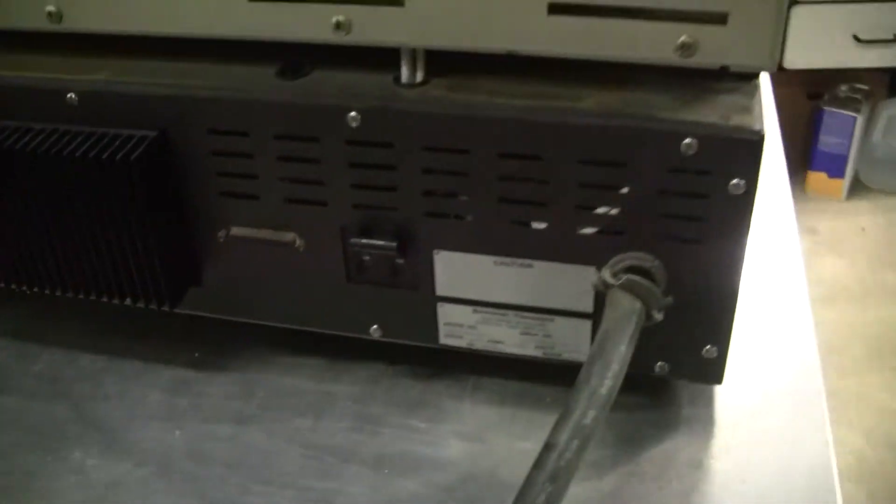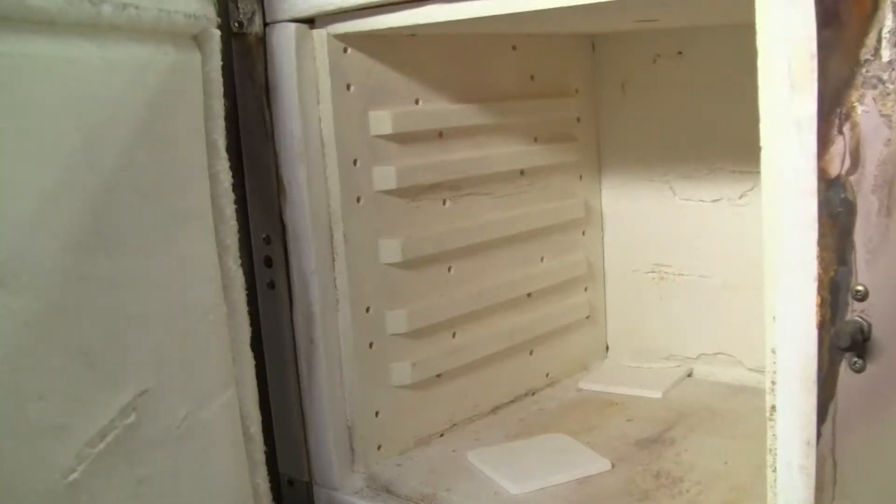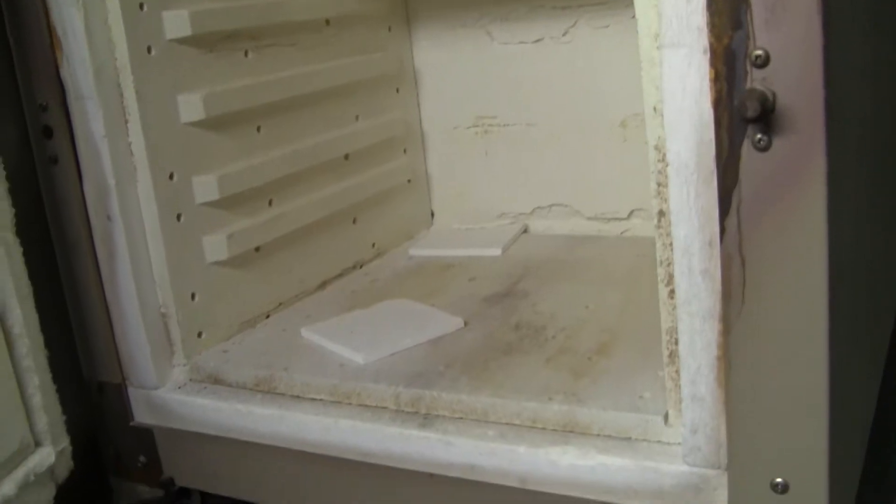It has a serial output for data in the back. Looking on the inside, it's going to get quite red, hopefully. Yes, there it is. Very hot.